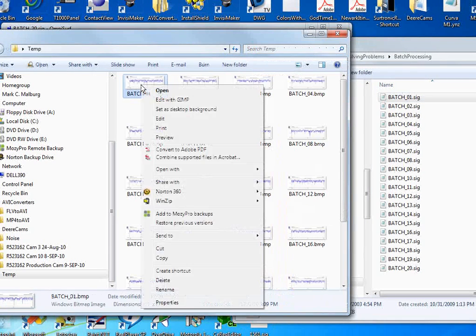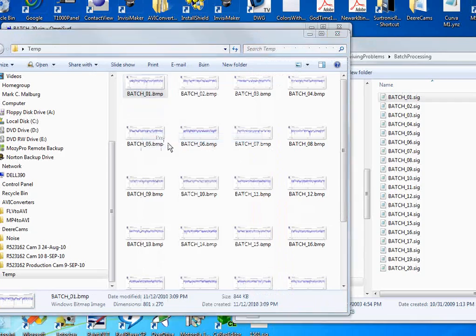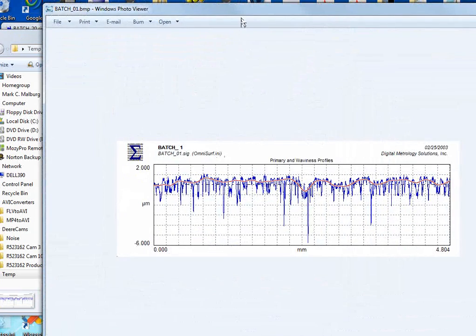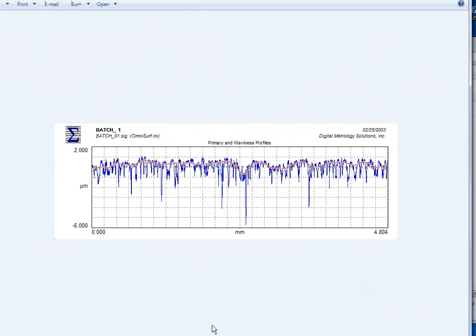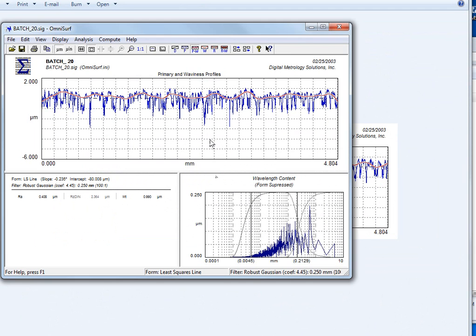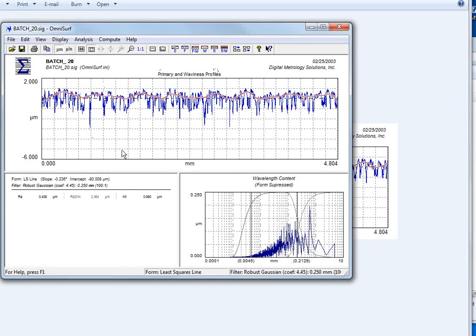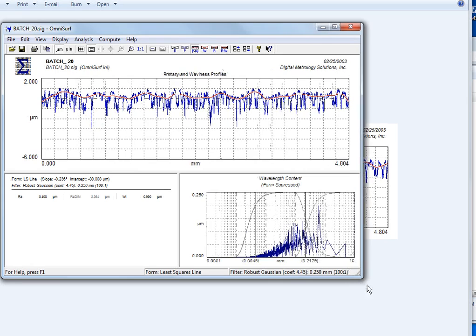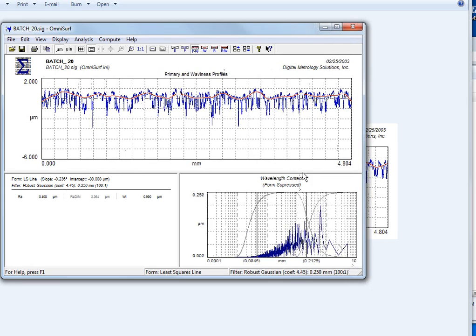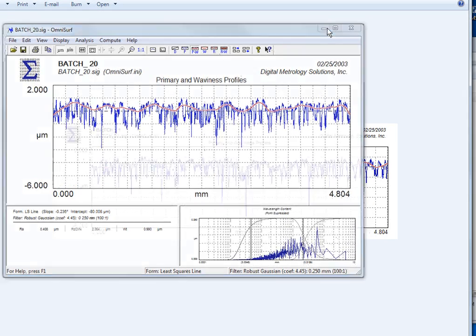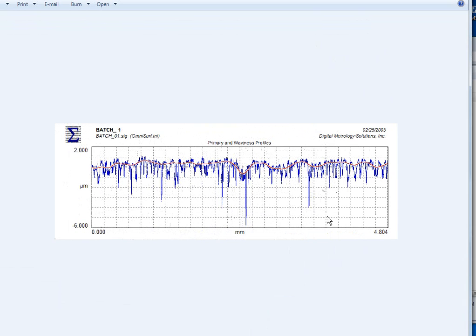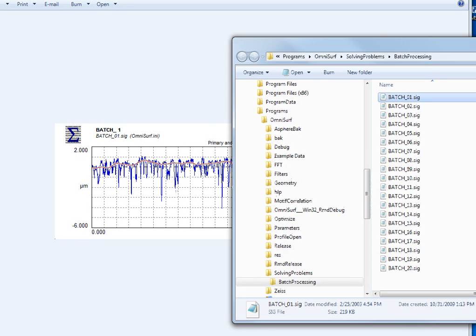And these bitmaps are the same size as the profile graph was in OmniSurf. If you look at the size of this image, it's the same size as this image in OmniSurf. So if you configure your OmniSurf to whatever size you want that image and run batch processing, you will get a directory or a folder full of images of profile graphs.